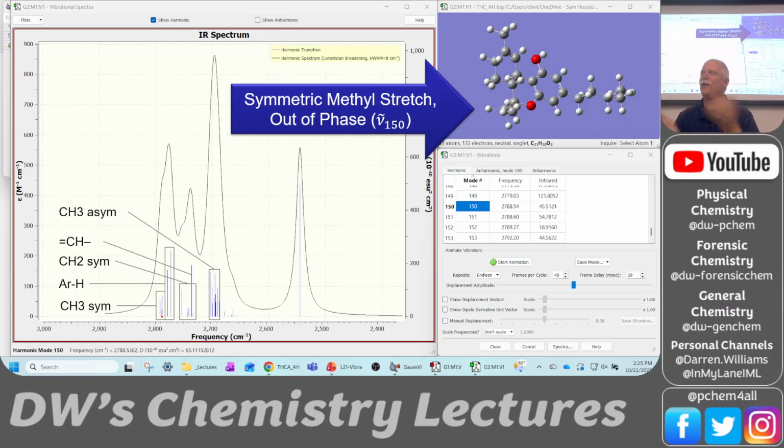So I know that y'all's molecules weren't big enough to have in phase and out of phase, but when I was writing up the plans, I was saying, talk about your spectra with terms like symmetric, asymmetric, in phase, out of phase. I was just listing the terms that we use to describe these motions. And I shouldn't have said in phase and out of phase, because y'all didn't have the possibility of having in phase and out of phase, really. You had symmetric or asymmetric, and that was it.